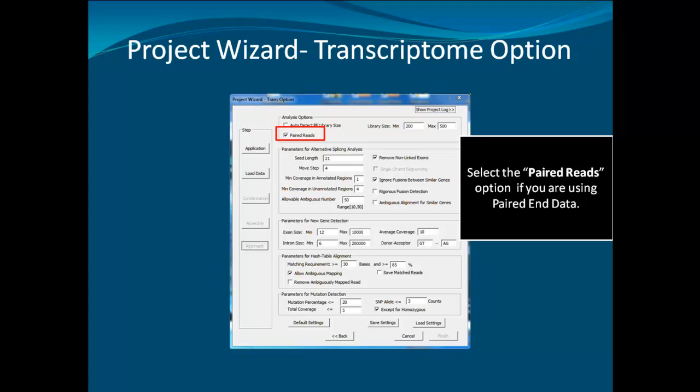Other options such as seed length and move step are used for the first alignment step and should usually not be adjusted. The allowable ambiguous number controls the maximum number of ambiguous alignments per read in the initial alignment. Remove non-linked exons will delete transcript calls where only one exon in a multi-exon gene is found. Rigorous fusion detection adds extra processing, including using small seed sizes near the ends of transcripts to find potential fusions. Ambiguous alignment for similar genes adds special handling for reads that align to multiple similar genes. New gene detection parameters can be adjusted if species-specific splicing is expected to differ, and parameters for hash table alignment control the second alignment step. Mutation detection parameters can be adjusted as needed.